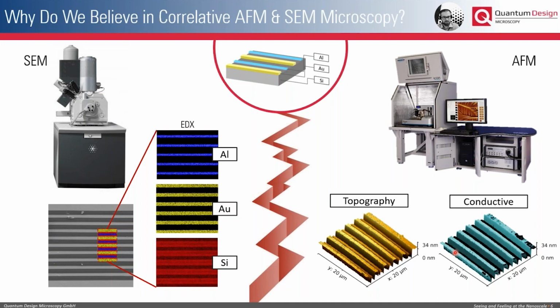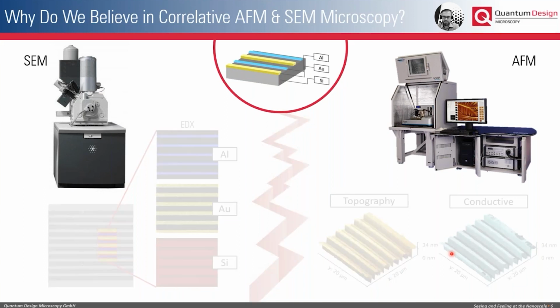You always have to break vacuum. You need to take the sample out of the SEM, transfer it to the AFM, and then try to find exactly the same sample spot, which in some cases is very cumbersome and time consuming, or sometimes even not possible. And this is why we here at Quantum Design Microscopy developed a tool that solves this problem.